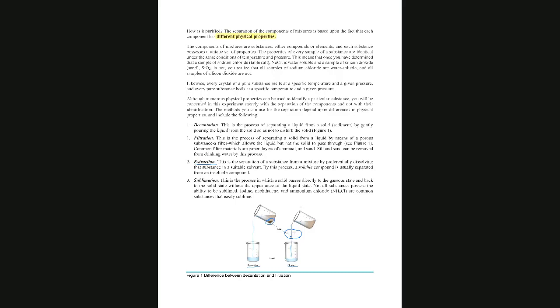So let's look at our example. In today's mixture, we have sodium chloride. And we know that sodium chloride, the table salt, is soluble in water. But sand, which is silicon dioxide, is not soluble in water. And we use these physical properties to separate them.